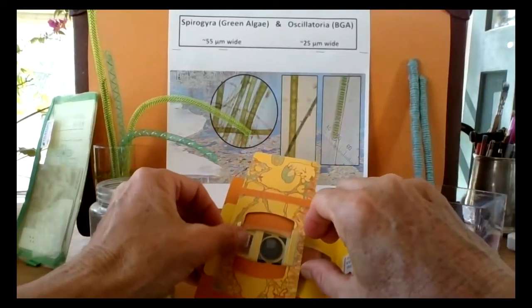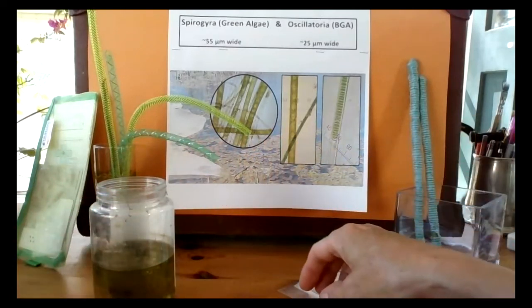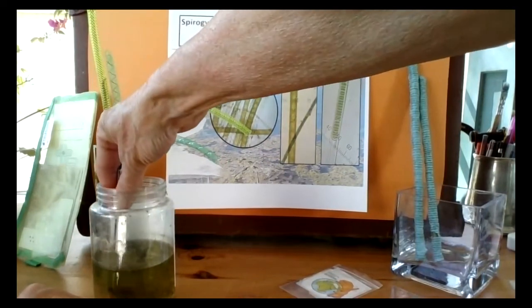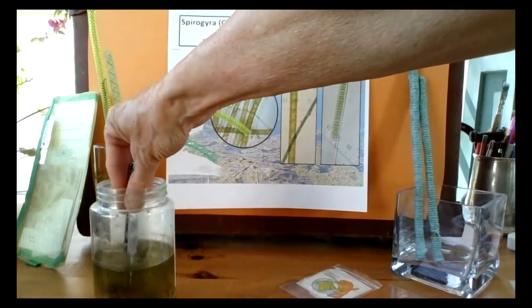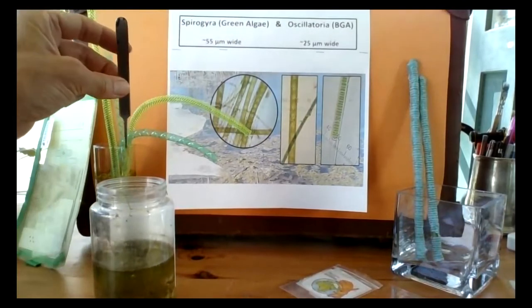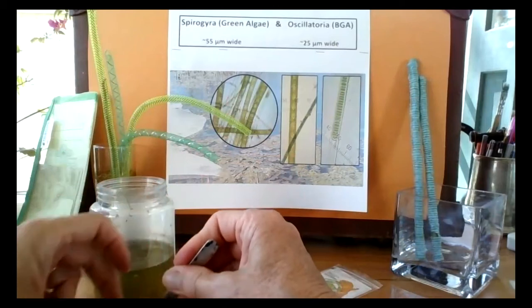Over to the back of your foldscope, take the slide out from one side and then the other. Put that to one side, and now we're going to take a sample of pond scum. I'm hoping that we'll get some spirogyra, sorry, not oscillatoria. I know we will get spirogyra because it's the dominant species group. It's very long filaments, very characteristic bright green.